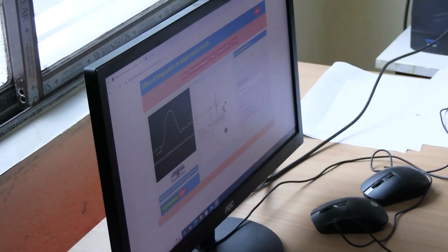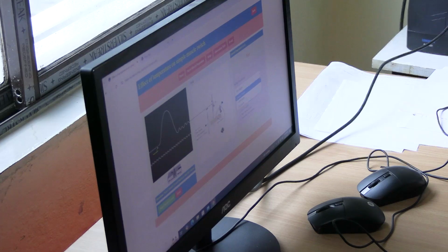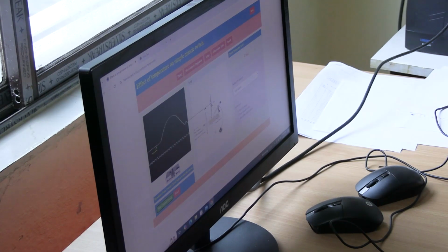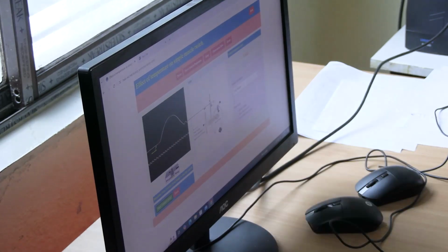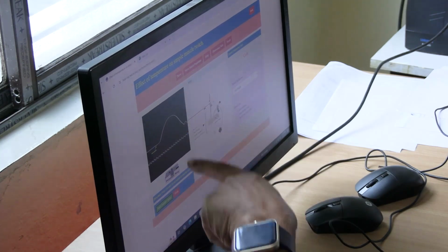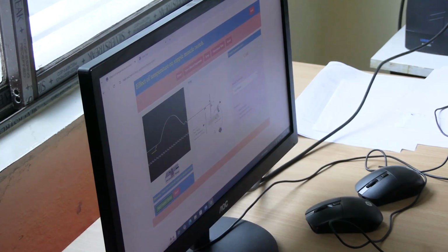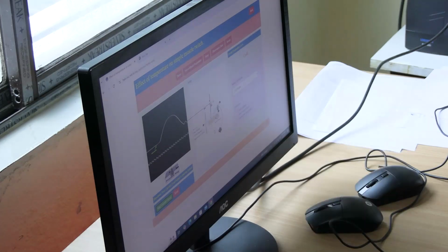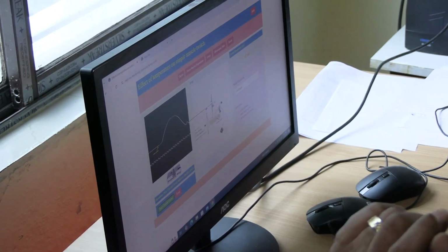Okay, now you change to cold. See, all the times, latent period, contraction period, relaxation period, increased. Okay, height also decreased. That is, rate of contraction slowed down. So these are the things recorded. From here you have to take the timing, calculate the timing.